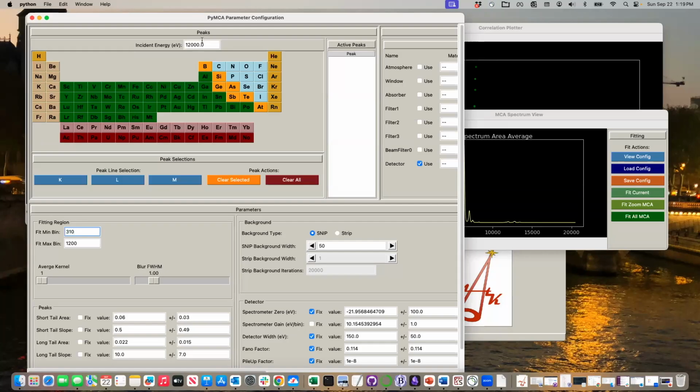So make sure of that, and this is most important when you're doing, say, a multiple energy map, going through the iron edge and mapping out a few energies that are around the edge value, but not fully above it. It's going to yell at you for not having any iron in it. So you just need to put the energy in and say, it's at 8,000, who cares? But just fit my peaks for me.